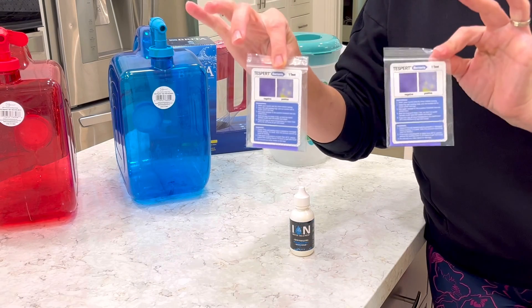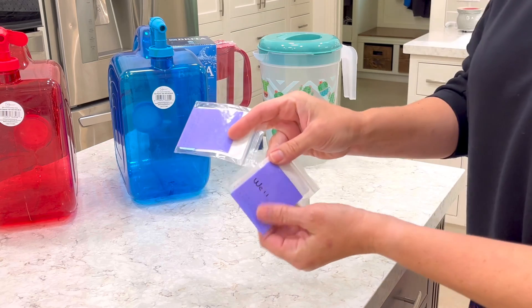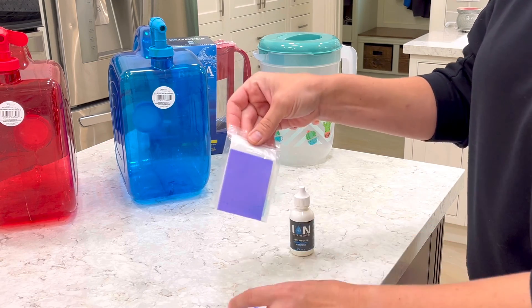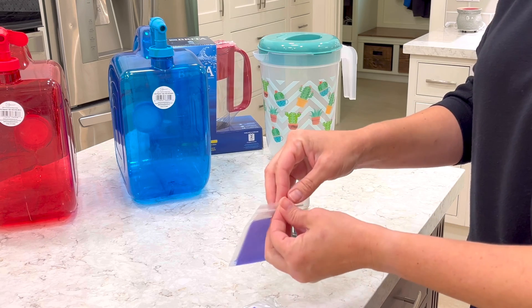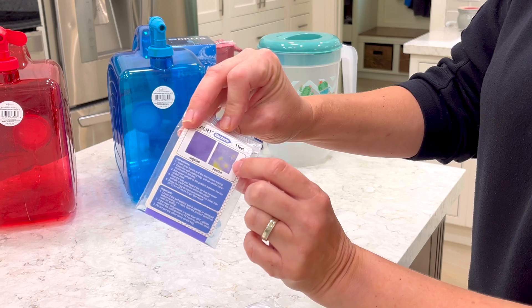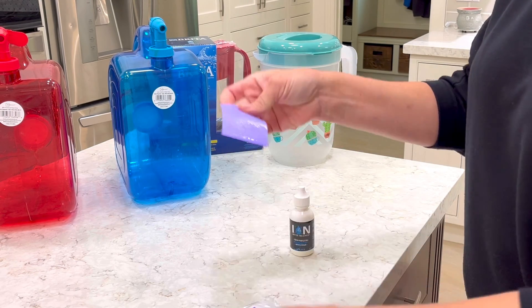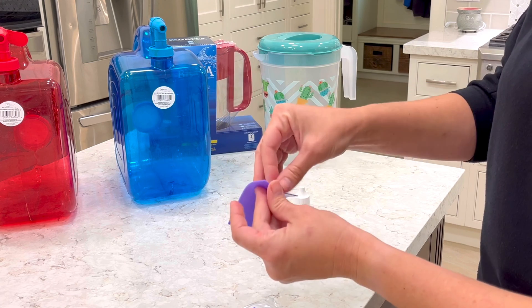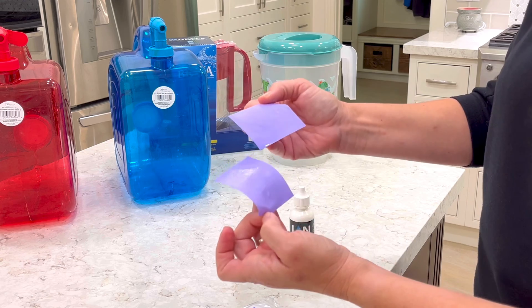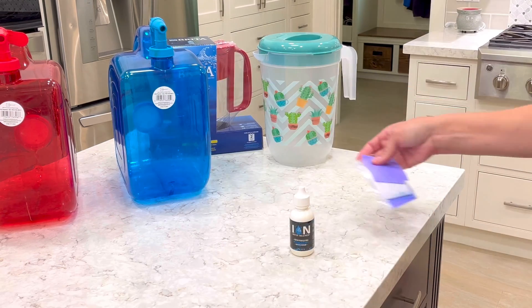It's 48 hours later, and we're going to take a look at the test strips inside these bags and see if they show any signs of bacteria. The packaging shows what a bacteria sign would look like — little yellow dots on that purple testing strip. I sped this up so it's not as boring, but as you can see, this is the emergency water supply test and there is no bacteria in that water. And of course my drinking water doesn't have bacteria either. So let's move on to the taste test portion.